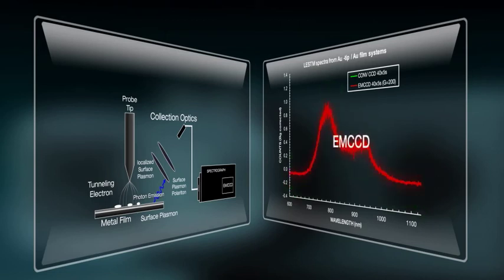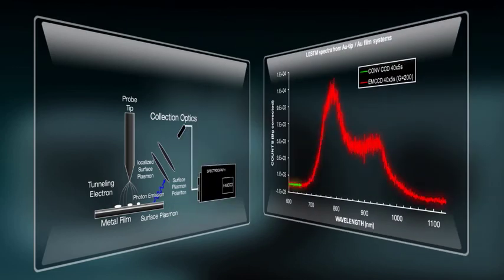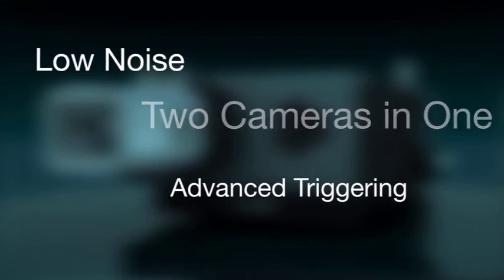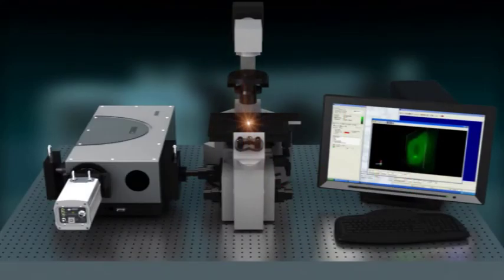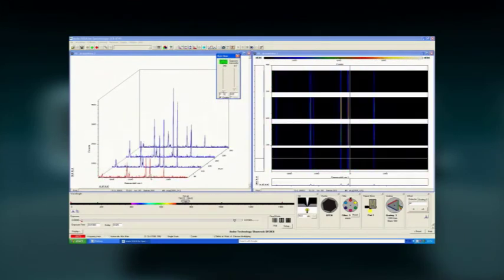EM technology provides for significantly enhanced signal-to-noise measurements when compared with the conventional CCD. The benefit of EM technology is only fully realized when having to work in a low-light regime. Low signals may be due to a very small sample size on a microscopic scale, or indeed down to the single molecule level, or the desire to use the lowest excitation power possible to prolong sample lifetime, or to achieve the highest spectral rates of acquisition possible so as to enable good temporal resolution on dynamic processes.